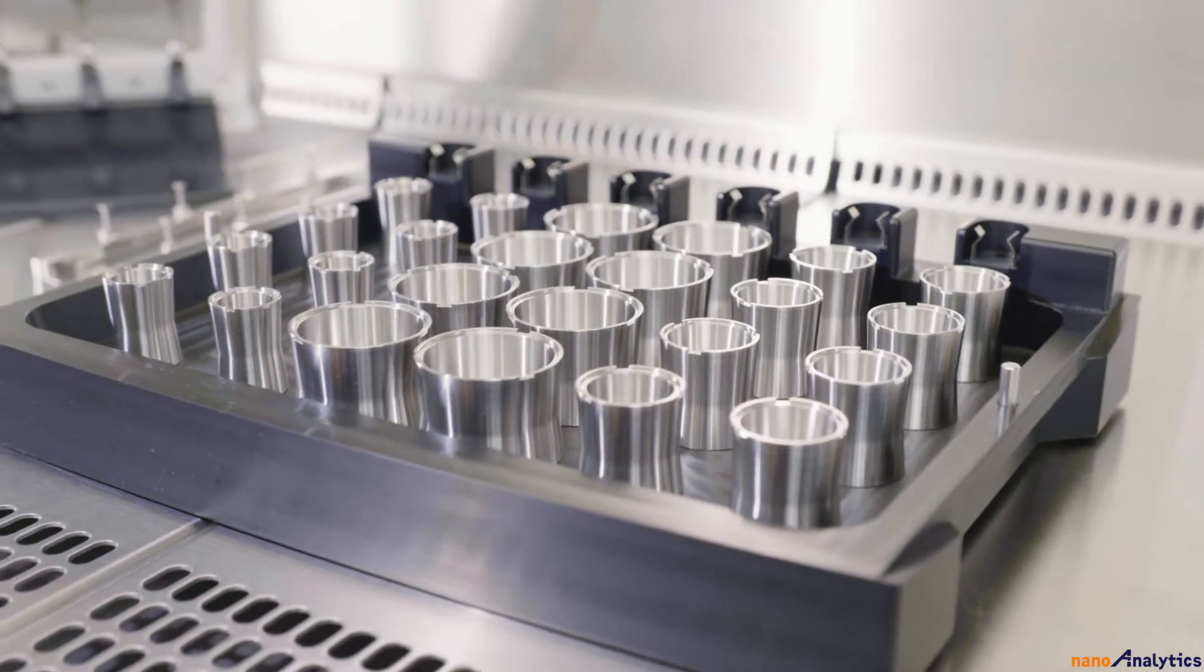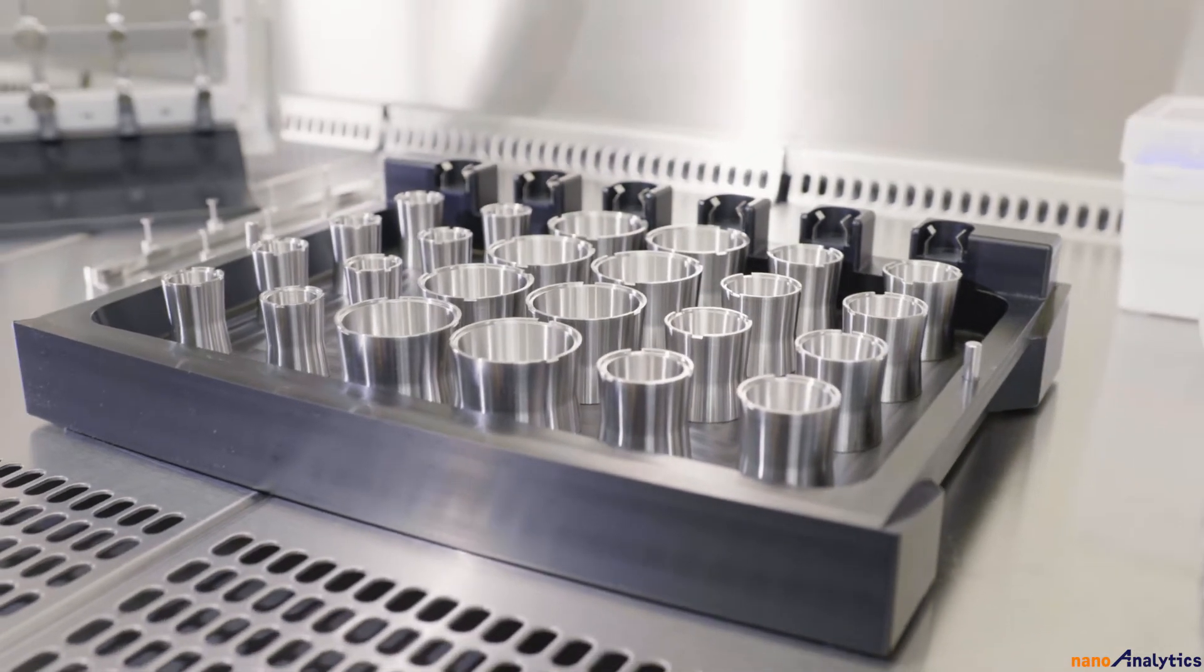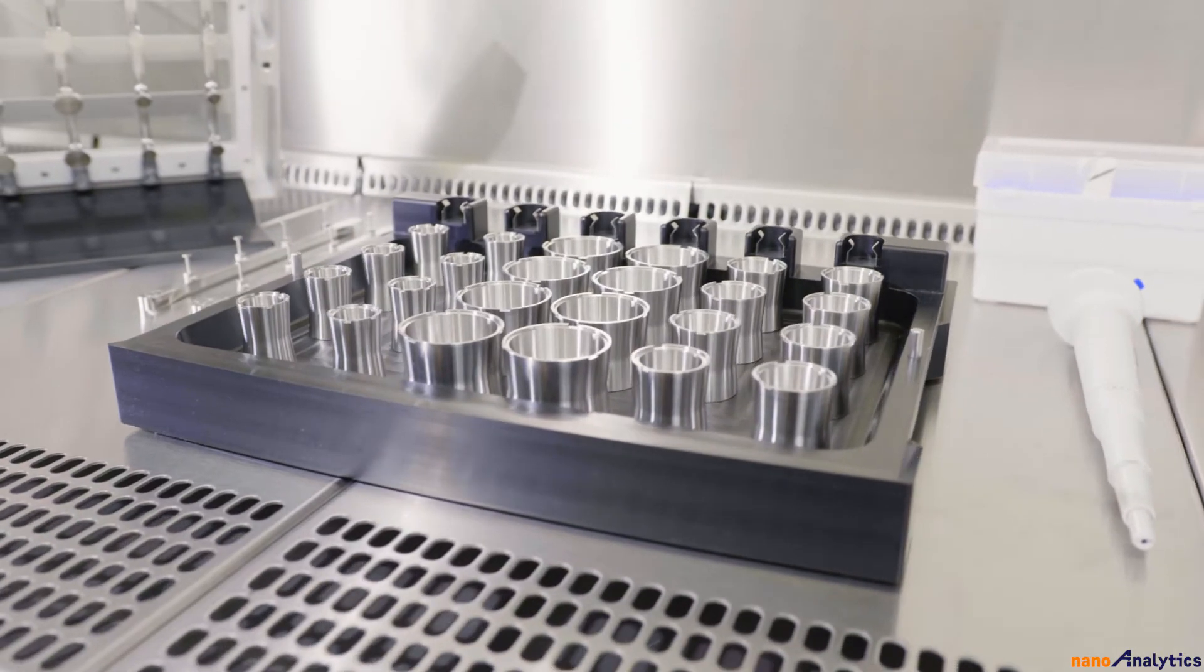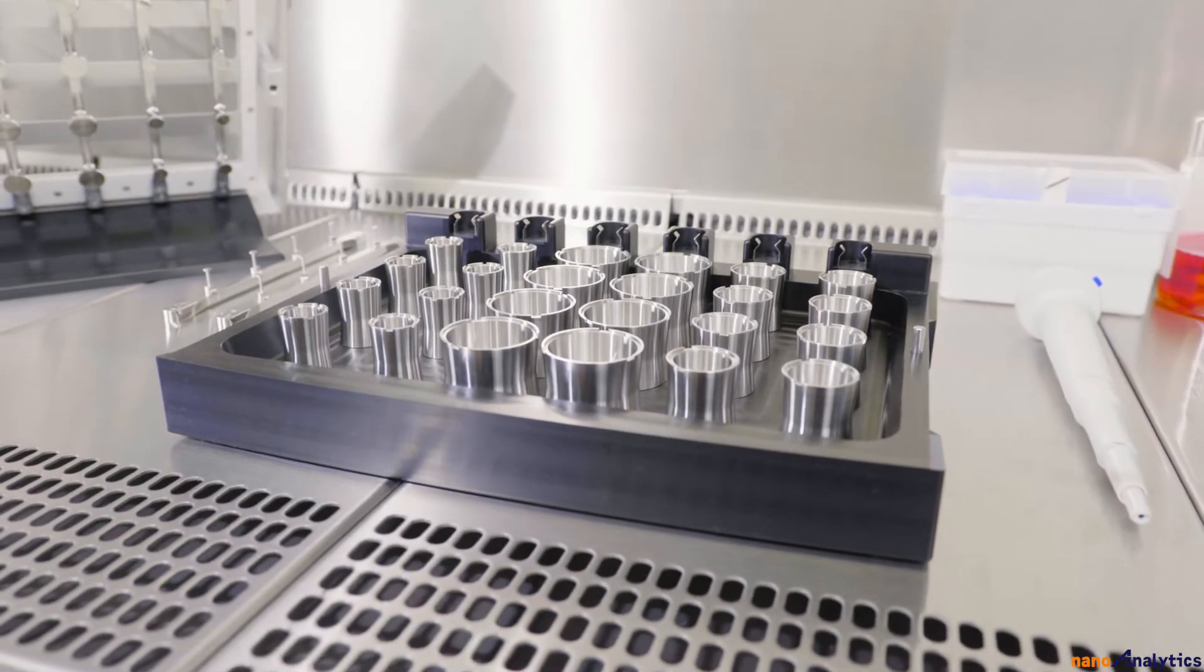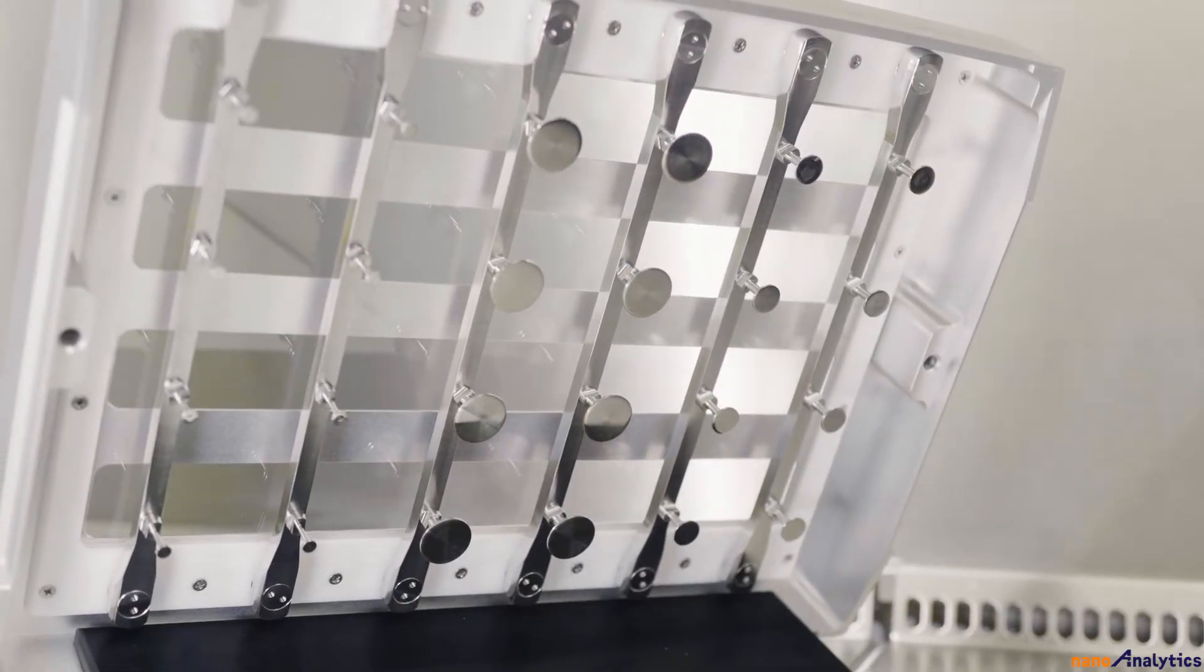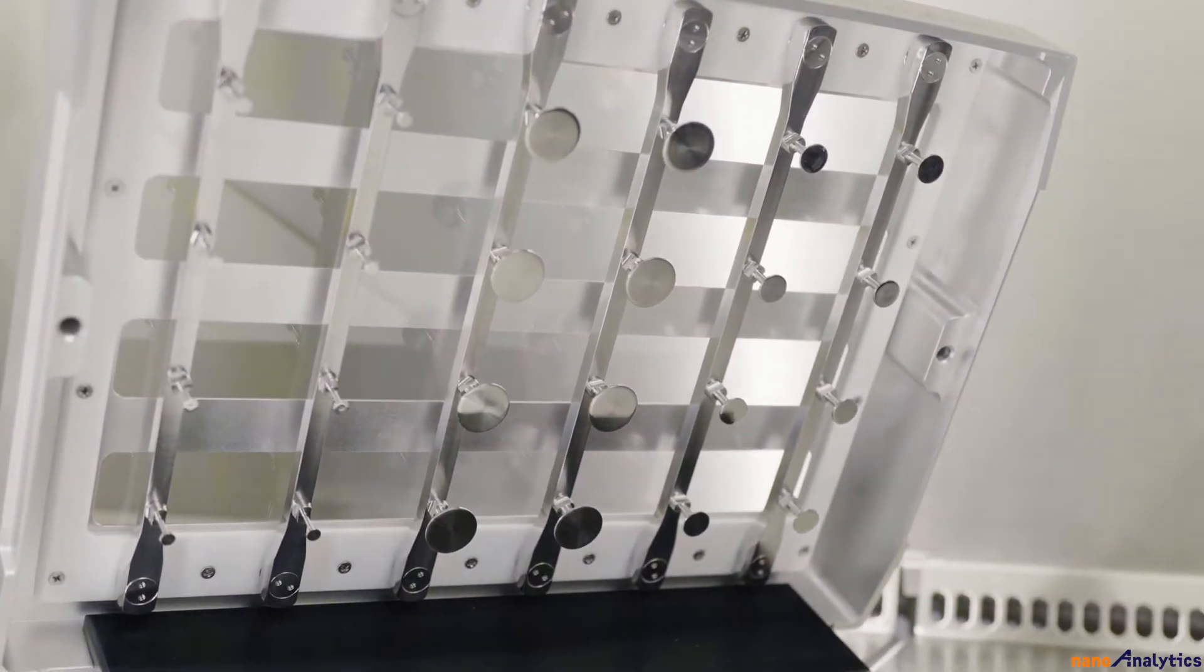All CellScope systems are designed using the finest materials, ensuring long-lasting durability and excellent compatibility with standard cleaning and sterilization methods. The electrodes are made of highest quality stainless steel and can easily be autoclaved.